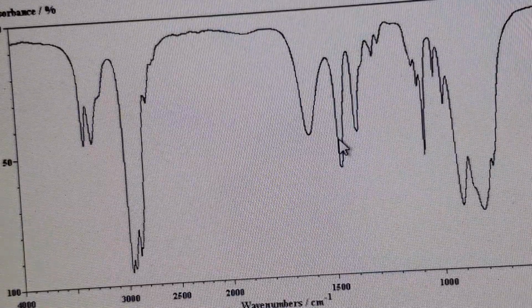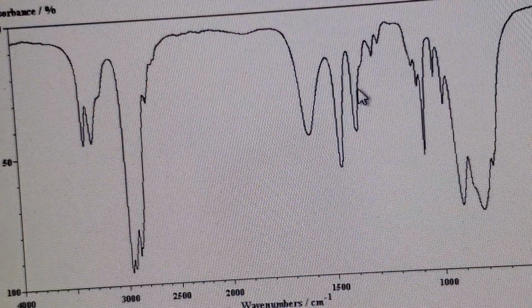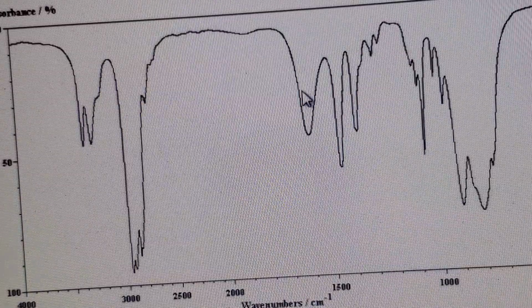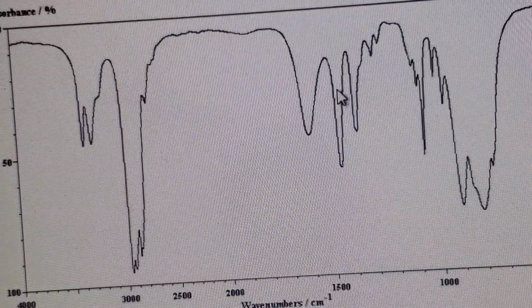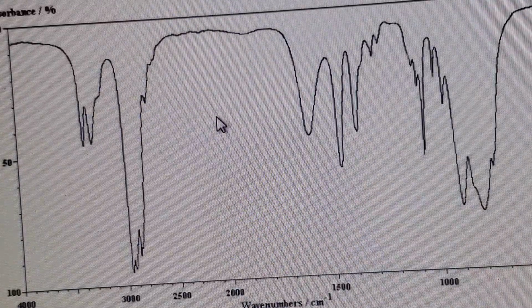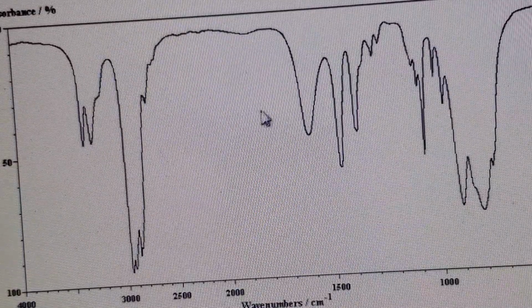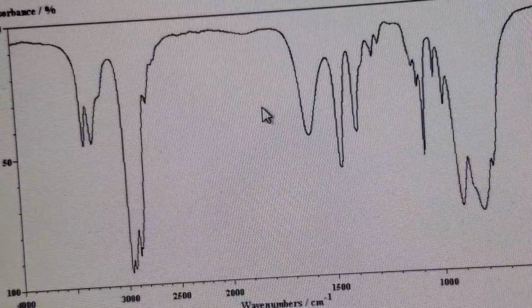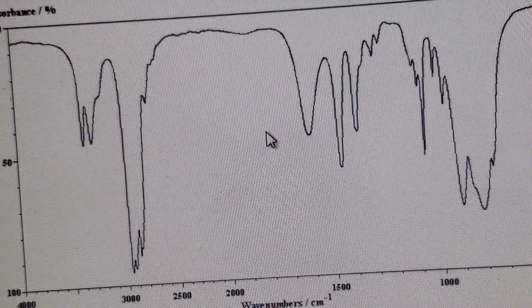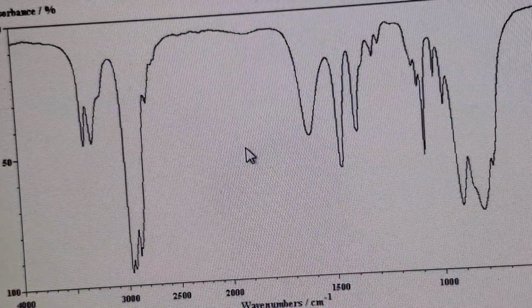So this means you have some intermolecular force on the bending vibration that made the value a little greater and broader. So these bending vibrations happen to be broad because amines are forming strong intermolecular interactions. So what we can say with confidence is this compound is an amine compound, a primary amine compound. So the answer for this is actually propylamine.